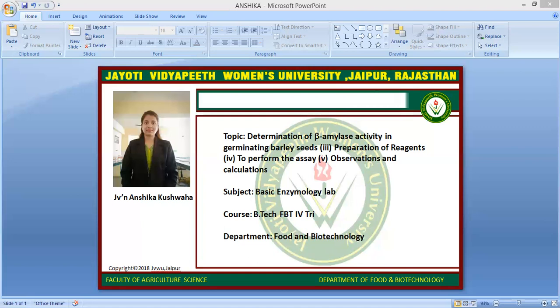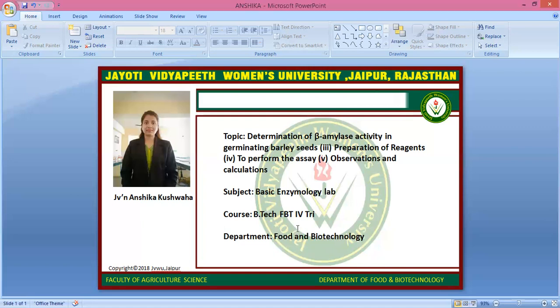After this, we will wait for the results. This is the determination of beta amylase activity in germinating barley seeds procedure. Hope you will like this video. This video is recorded by Digital JVW 2.0. If you have any query, you can write it down in the comment section. Thank you.